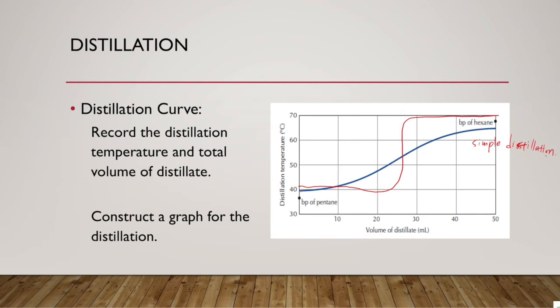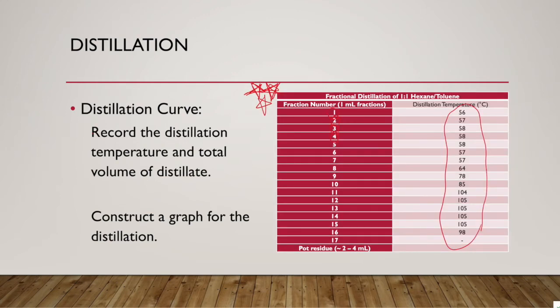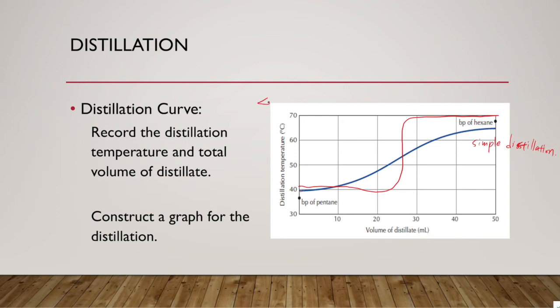I mean, we used to do it before the pandemic, but now we're just doing fractional distillation. Okay. So you have to complete this distillation curve for the report.